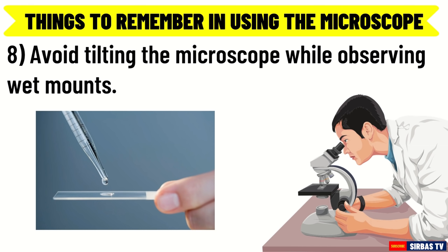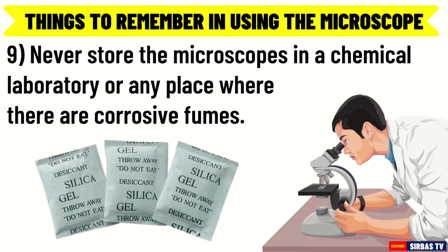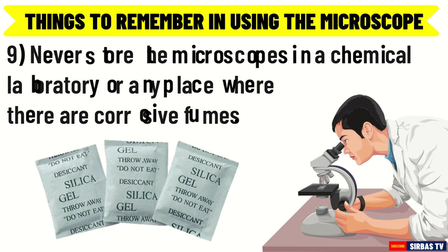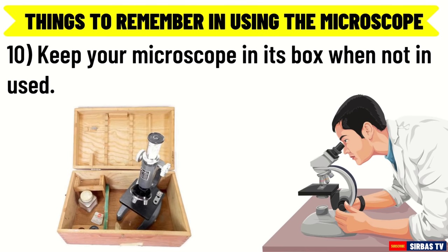Avoid tilting the microscope while observing wet mounts. Water might flow into the mechanical parts of the microscope causing them to rust. Select a chair with suitable height so that both forearms can be rested on the table during observation. Number 9: Never store the microscope in a chemical laboratory or any place where there are corrosive fumes. Make sure there are silica gel packs inside microscope boxes or storage cabinets to absorb moisture. Number 10: Keep your microscope in its box when not in use.